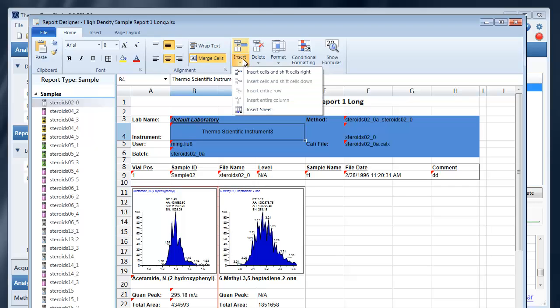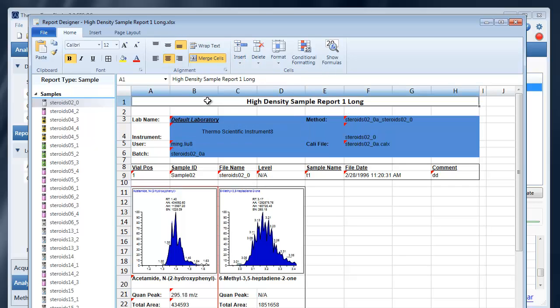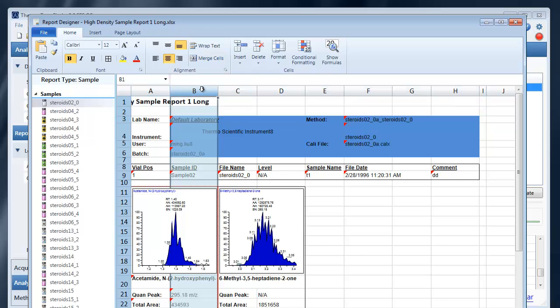Next you have the ability to insert. And you can insert cells and shift to the right. You'll notice that you need to, you can't insert when there's merge cells. So you may want to unmerge your cells.